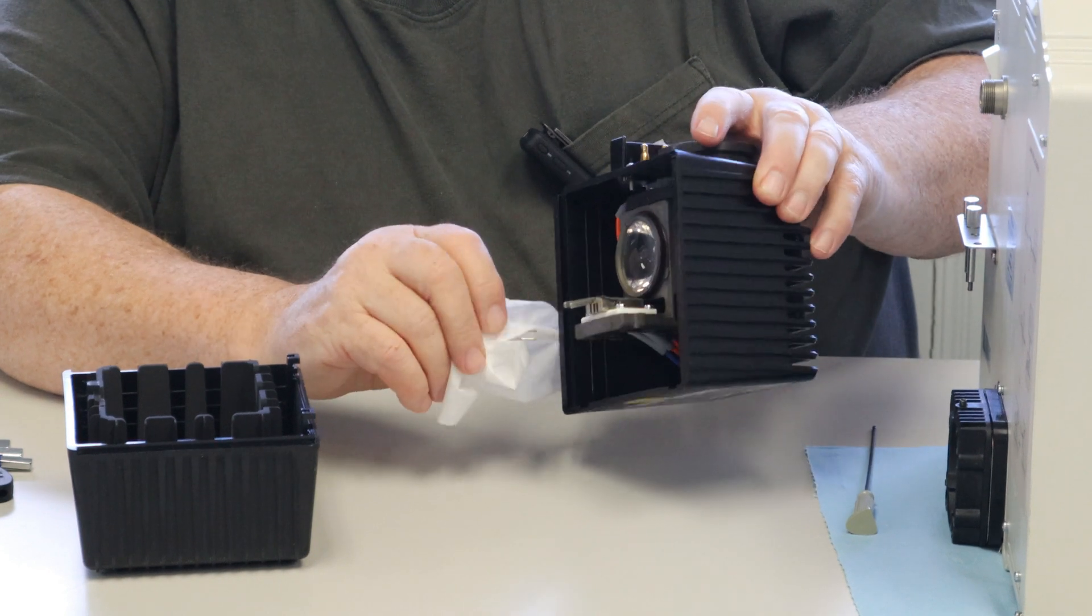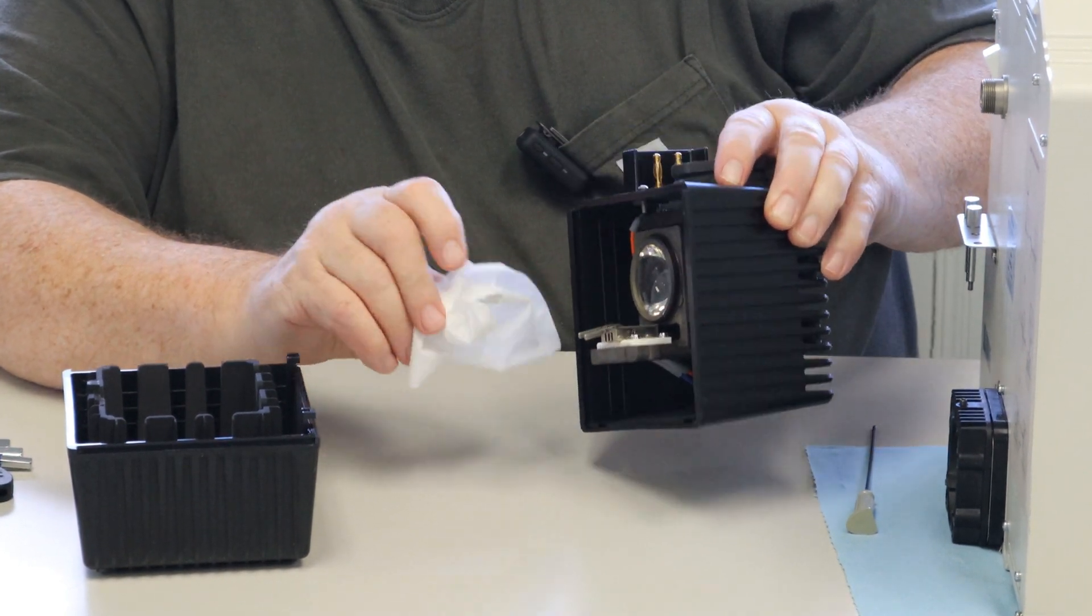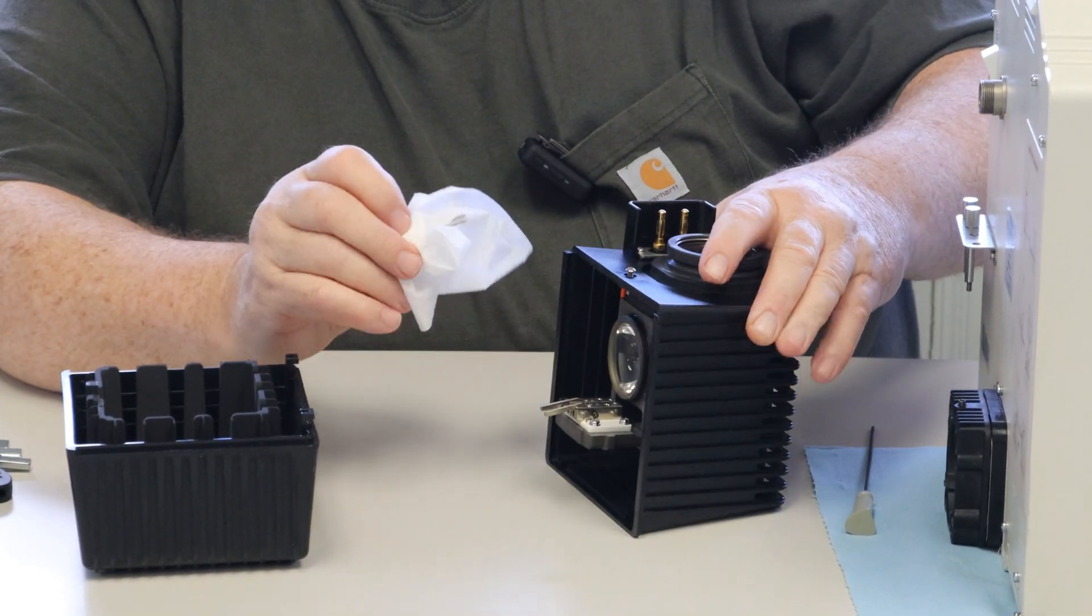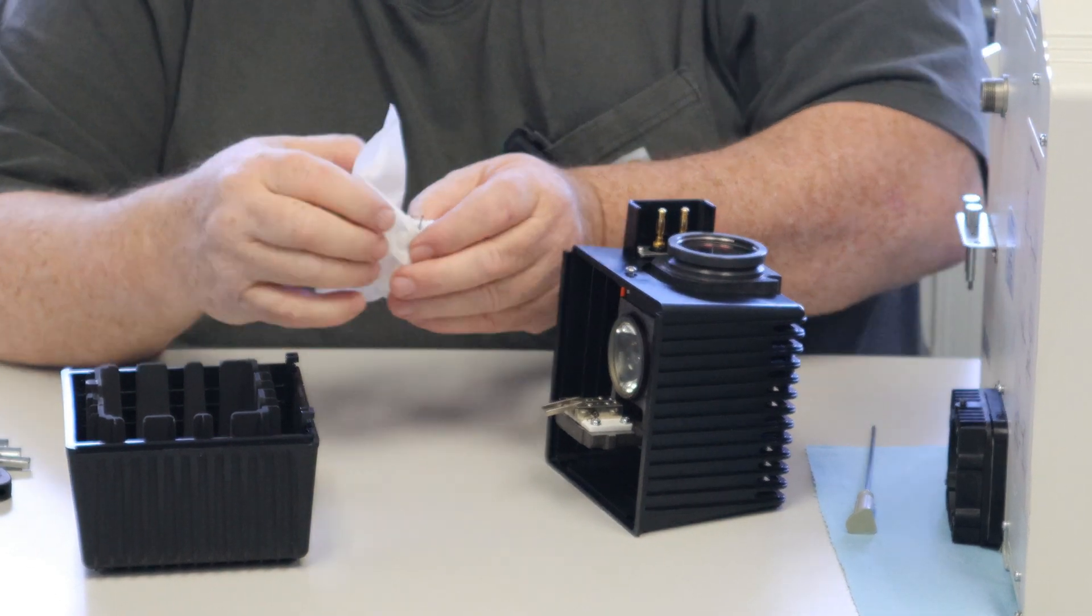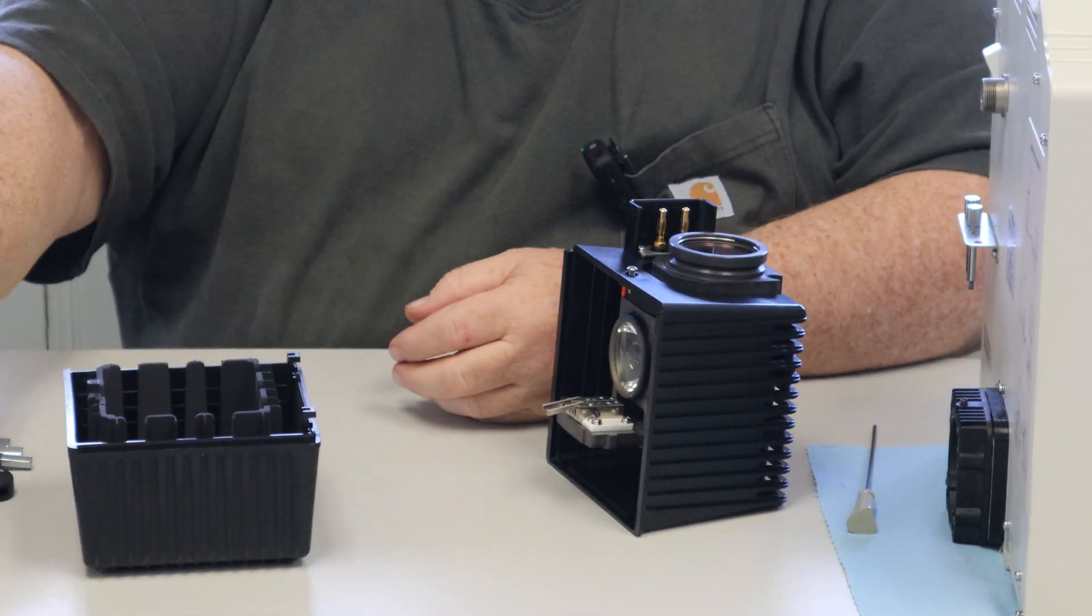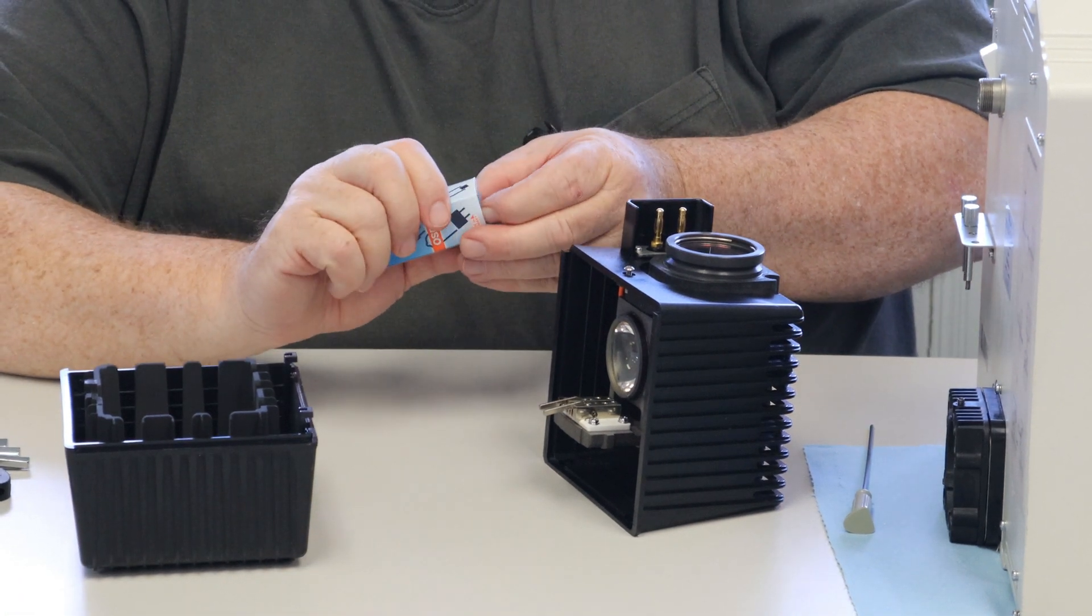On this scope again, with this set up, you don't have to worry about the arcing in the lamp housing. Now go to the new bulb.